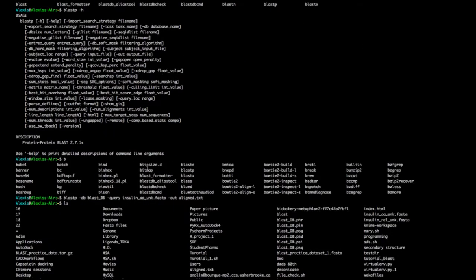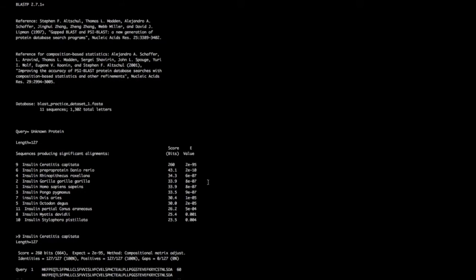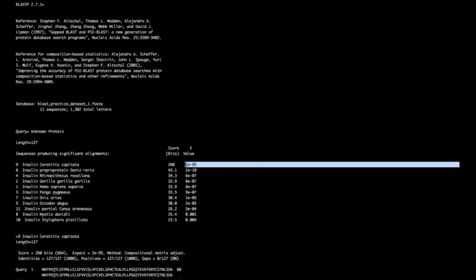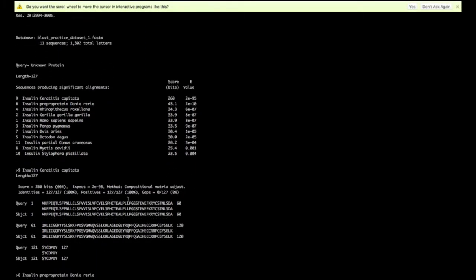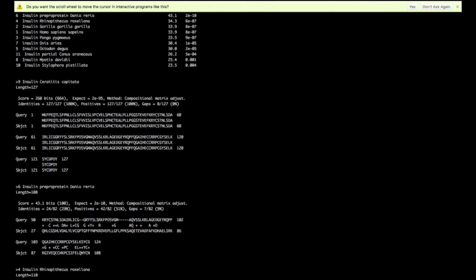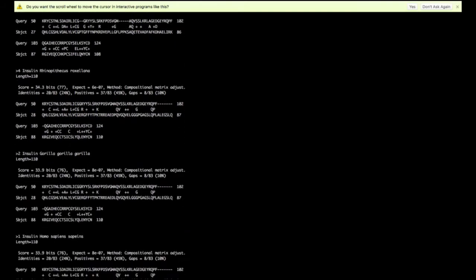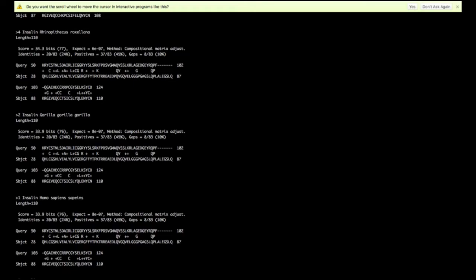We've aligned it and can now determine the most probable match. We see an E-value that's really high — actually, the E-value represents the chance that our sequence matches by pure random chance. Here it's about 2 to the minus 95, so it's almost impossible we got a match by mistake. All sequences are quite similar — insulin is broadly conserved across species.